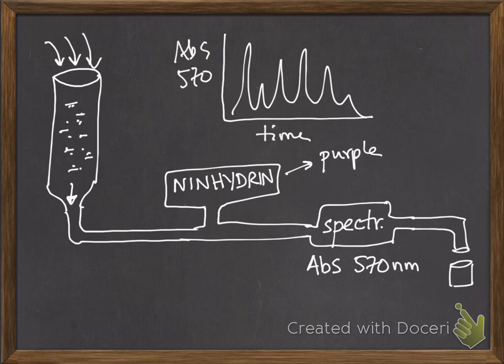And your x-axis could also be labeled the pHs of your buffers, but I think time is more accurate because you'll pour your buffers through in a regimented sequence, maybe 1 minute in between each pour. And so then you could just measure everything by time that's coming off of the spectrophotometer.